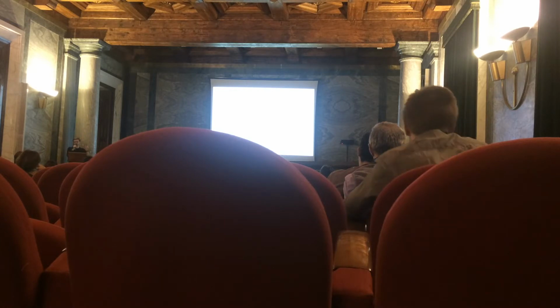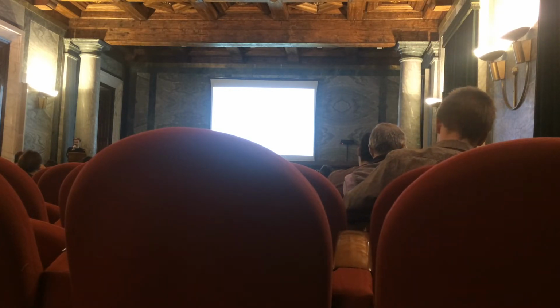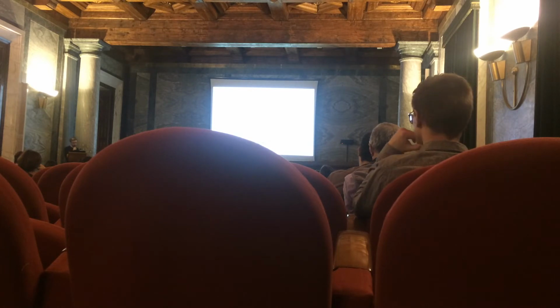We calculated two densities, one for CG coverage, another one for CG density, and the ratio between the two is the so-called U density. This U density normalizes for CG content. It uses information from the neighboring CG sites. It normalizes for library size. Everything works perfectly. We published the thing in 2017, but there's still room for improvement.